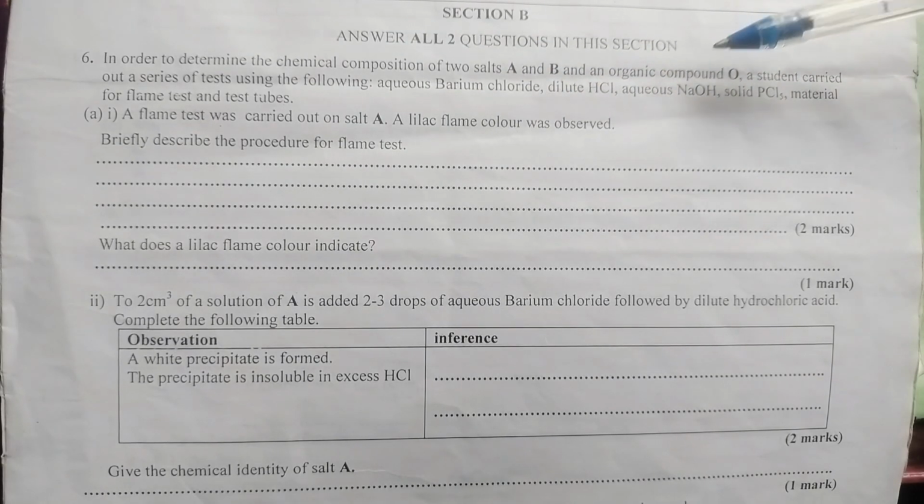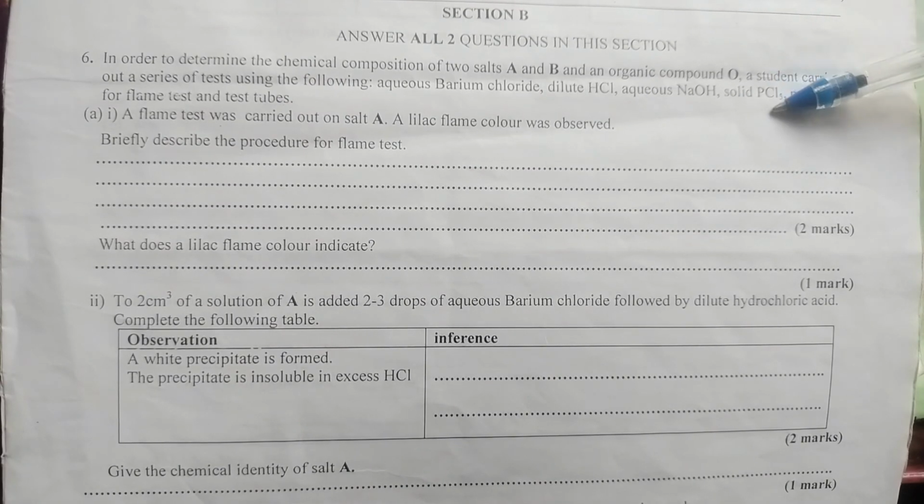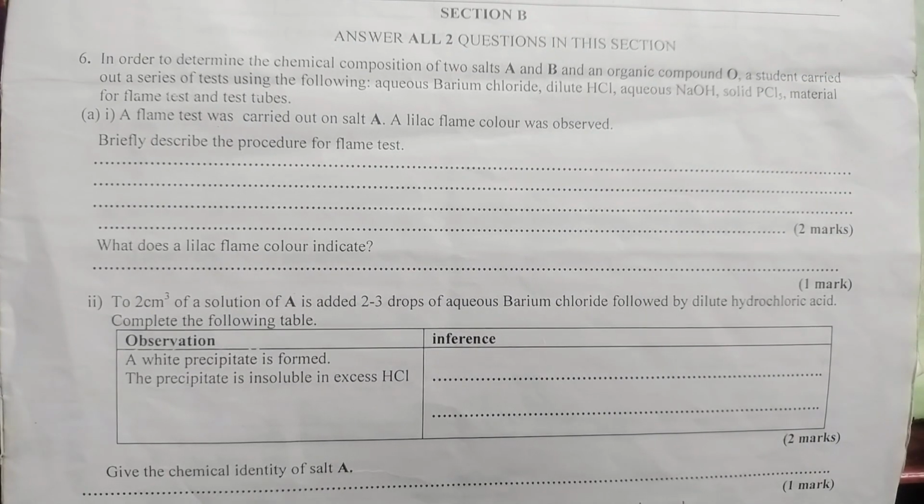Dilute hydrochloric acid, aqueous sodium hydroxide, solid PCl5. This PCl5 is used to test for the presence of organic compound. And materials for flame test as usual. A flame test was carried out on salt A. A lilac flame color was observed. Briefly describe the procedure for flame test. We have a video on that. Please watch it. What does a lilac flame color indicate? Lilac flame color indicates the presence of the potassium ion.